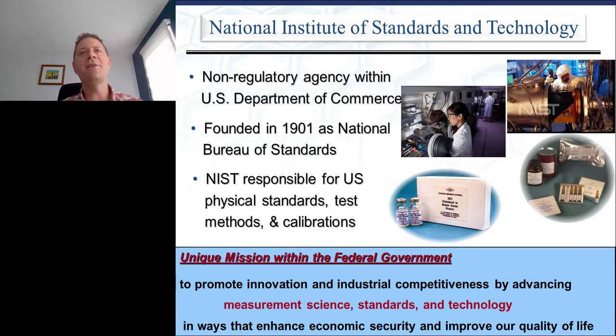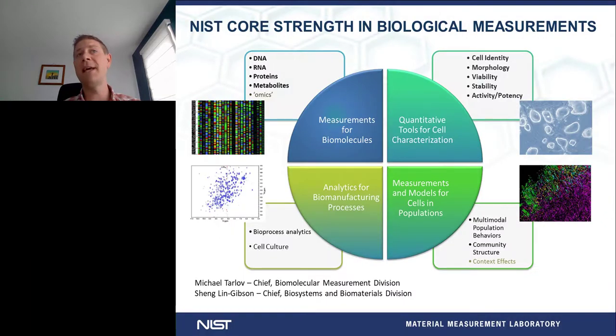And we have a reference material that diagnostic companies can actually use to calibrate their measurements, calibrate their instrumentation. And we provide a material that's actually traceable to the actual SI unit of the kilogram. So we know exactly how much cholesterol is in that vial, and everyone throughout the United States can then calibrate their individual measurements on this particular vial of cholesterol. So we actually do this for a wide variety of individual technology and measurement types.